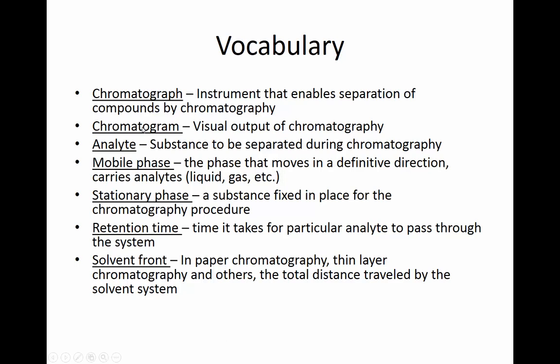A chromatogram is a visual output of chromatography. You'll be making a chromatogram in your lab this week. Analytes, these are the substances to be separated. So every compound in a mixture that is separated by chromatography is called an analyte.